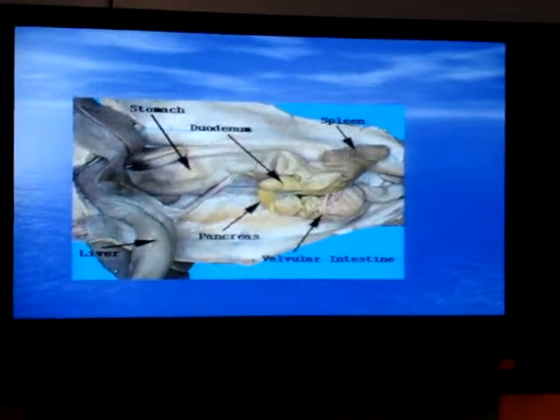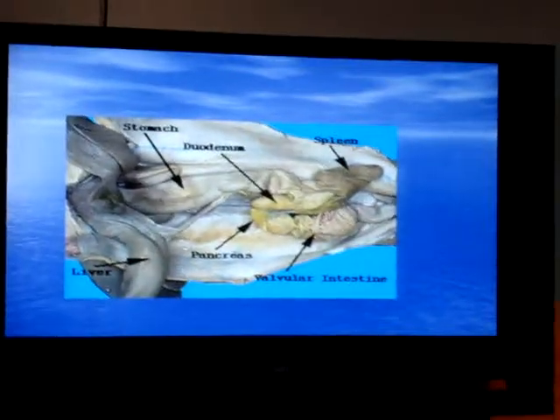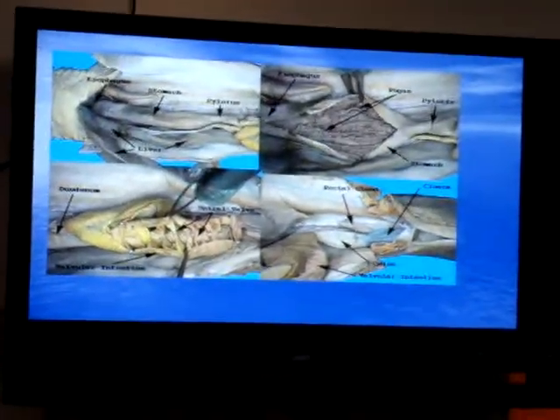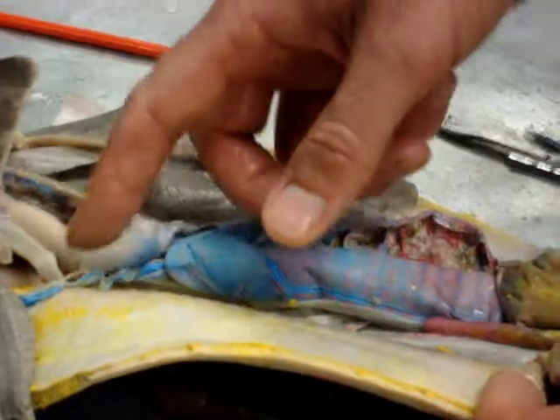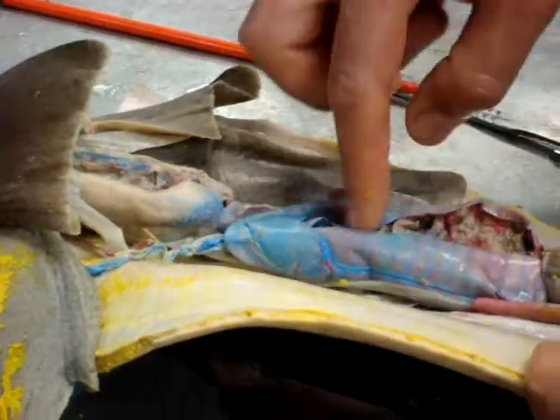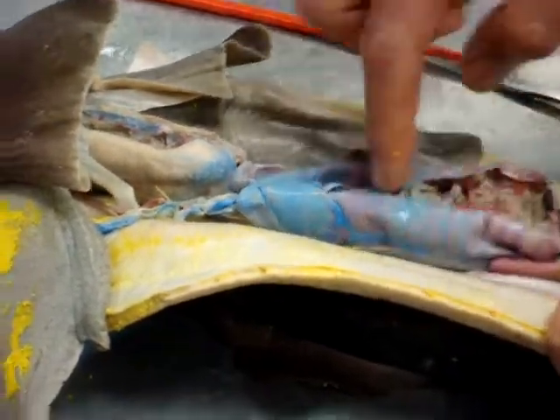Alrighty, so let's take a look. A spleen we got, there's a stomach, duodenum is a U-shaped one, there's the massive liver. A valvular intestine, which we have opened up nicely to see the spiral valve. What's that D-shaped thing? Again, that's going to be part of the reproductive system that we're going to talk about shortly. Take a look at our spiral valve really quick. Okay, so we saw the rugae in the stomach. We saw the papillae in the esophagus. We saw the spiral valve inside the intestine with lots of doo-doo.